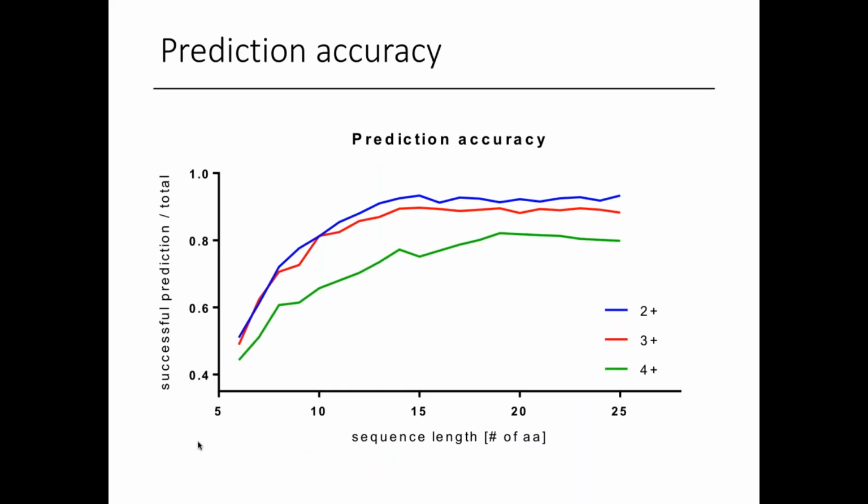Another thing is that in our training data there's actually a bias. The bias is not introduced by us; it's just the length of naturally tryptic digested peptides that can be sampled by the mass spectrometer. The average or most frequently seen peptide length in our training data is around 12 to 13. So I think that could be the other reason, but for now I don't know which one contributes more to this accuracy. Right, thanks. Okay.